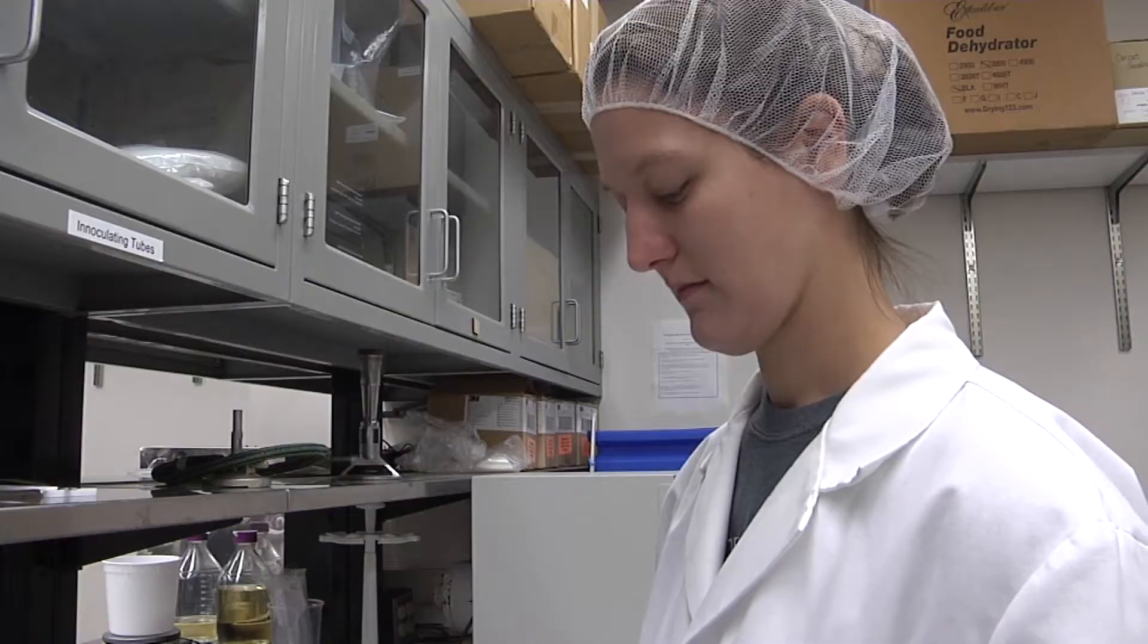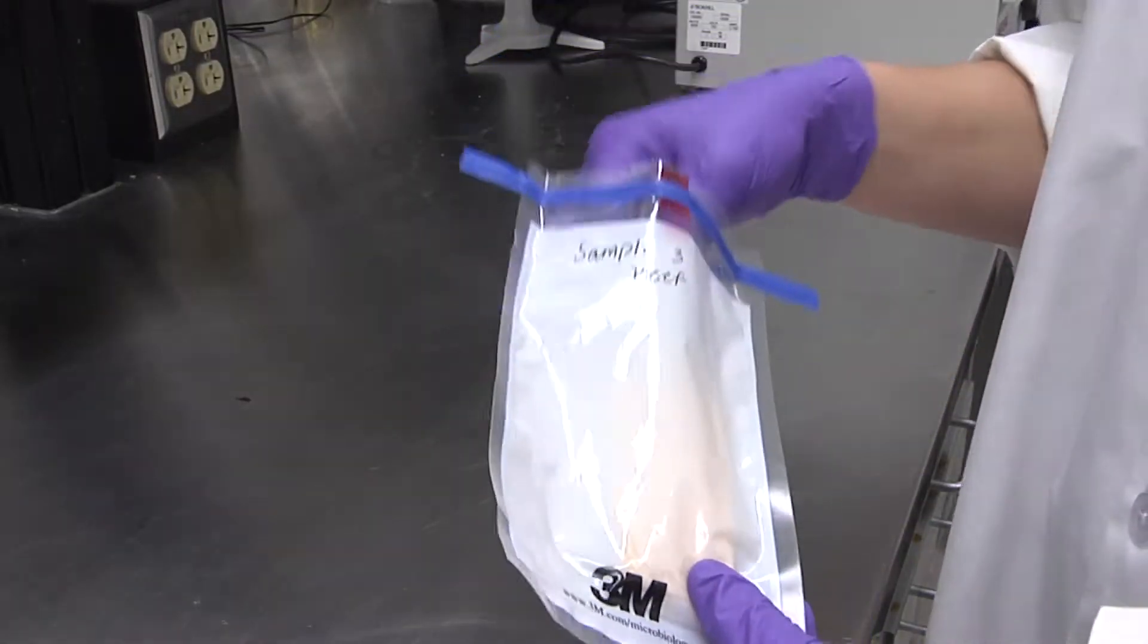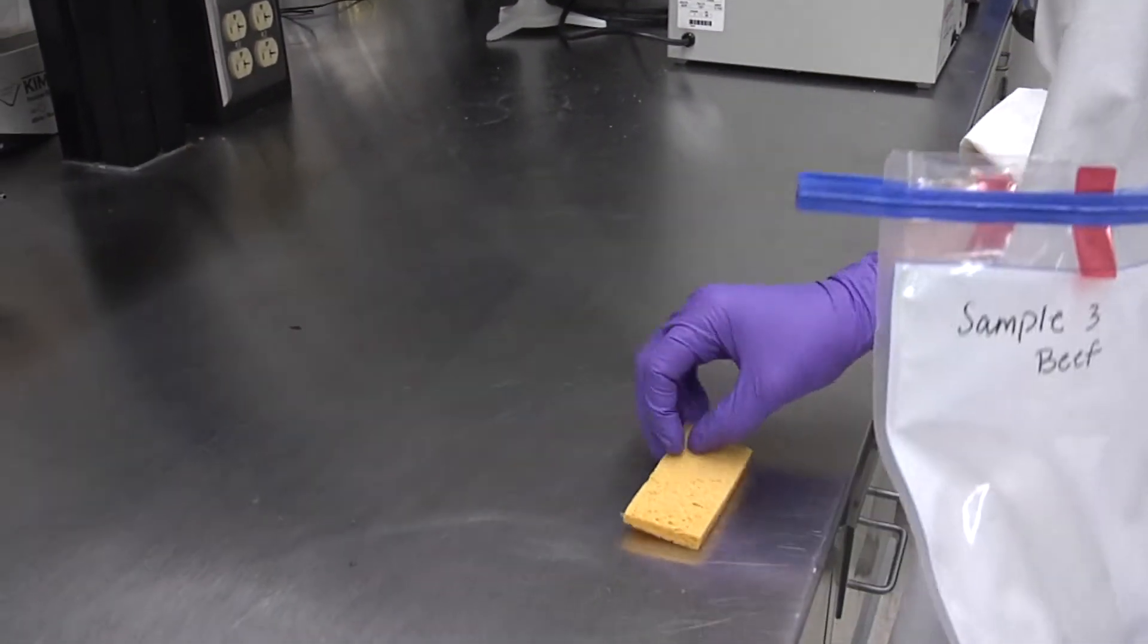Place the sterile gloves on your hands, open the bag with the moistened sponge, and then remove the sponge from the bag.